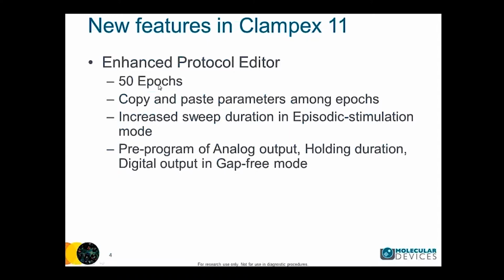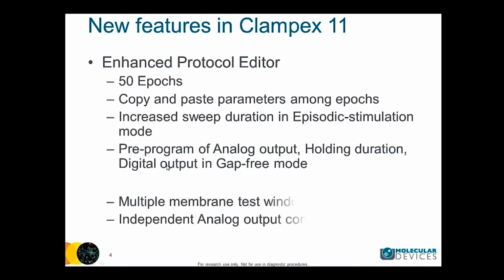We also allow you to copy and paste parameters among epochs. We also increase the sweep duration in episodic stimulation mode. And one thing that I like is that now in the gap-free mode, you can pre-program the analog output, holding duration, and digital output.